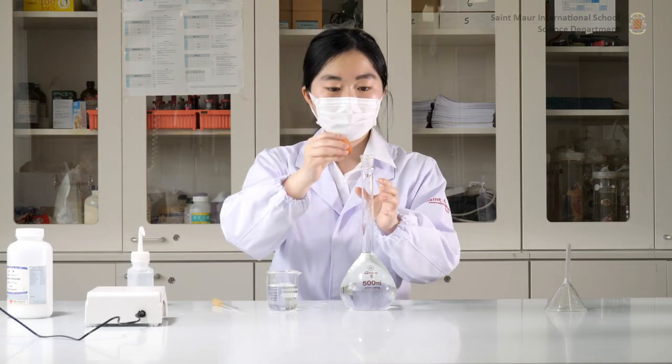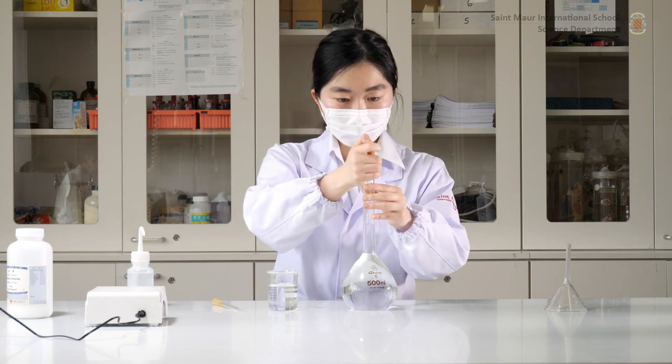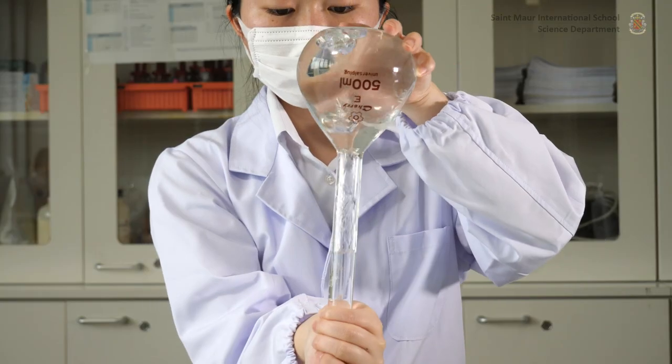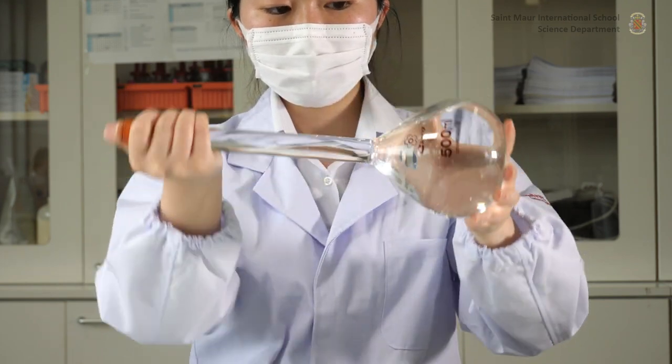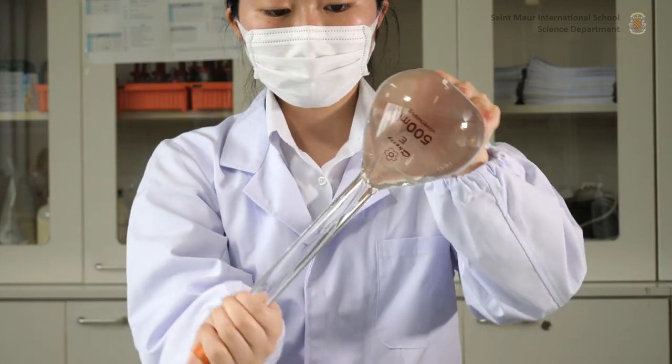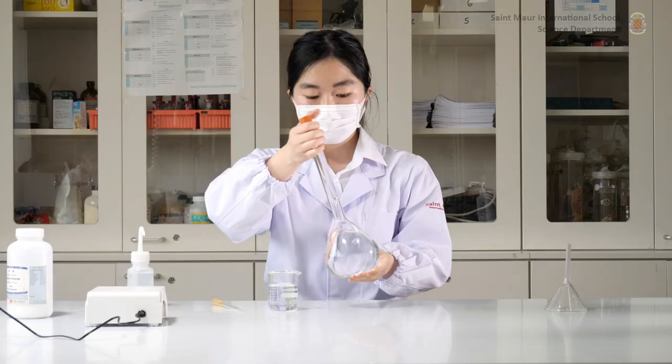Finally, place a stopper at the mouth of the volumetric flask and turn it up and down a few times to homogenize the standard solution. Apply smooth movements, avoiding shaking the flask in order to prevent the formation of bubbles or foam.